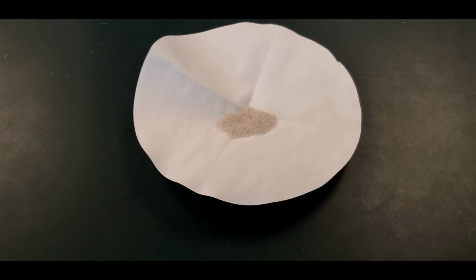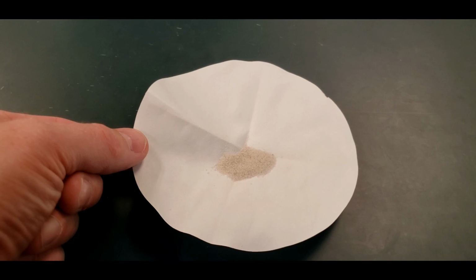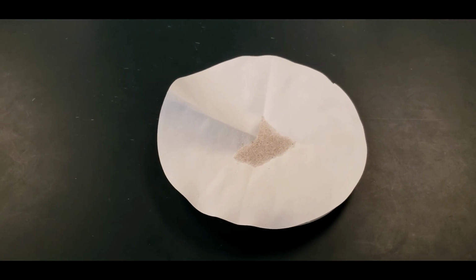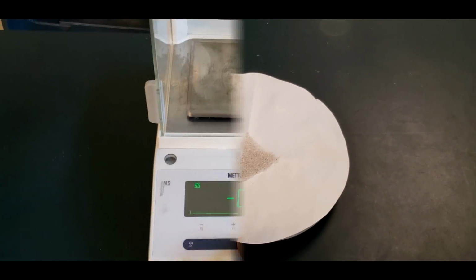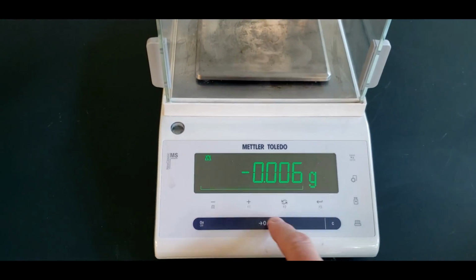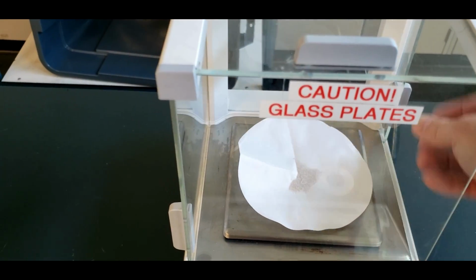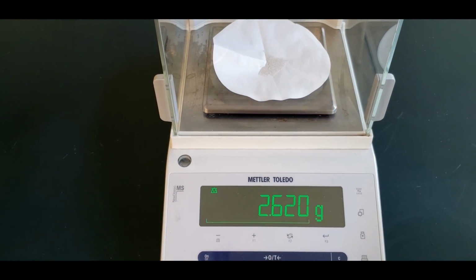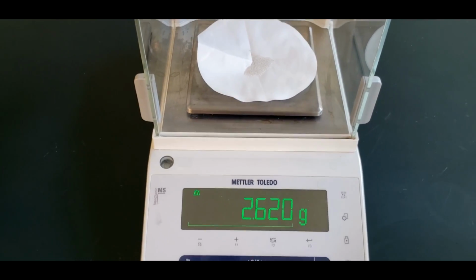Here's the sand out of the oven. Can't really tell if you're just looking at it, but the paper is very dry, and the sand is moving around really freely, so that's a good sign that it's nice and dry. So we'll weigh it now. Okay, we're going to put the filter paper, 2.620 grams, and then we'll subtract off the filter paper to find out how much that sand weighs.